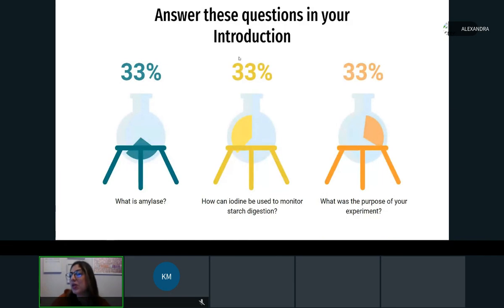So there are going to be 3 questions that you're going to answer in your introduction. Again, you really want to make this more informational to your reader, not just straightforward, like "I was told I have to answer the question, so here is my answer," right? So what is amylase is going to be one of your questions. How can iodine be used to monitor starch digestion? And what was the purpose of your experiment?